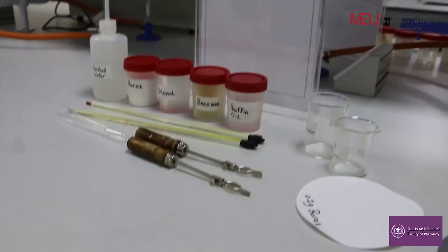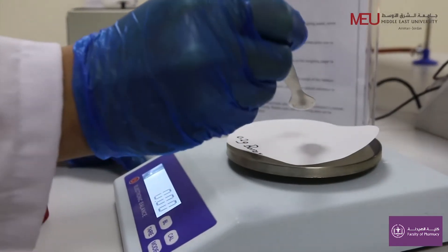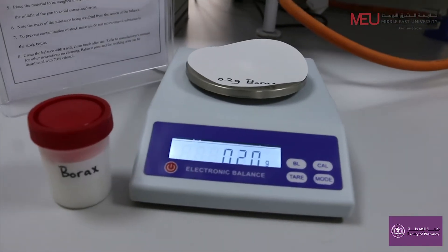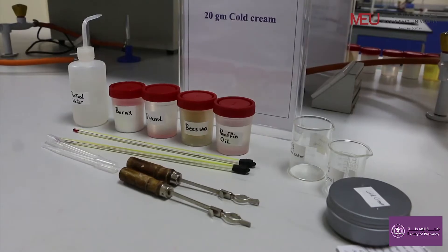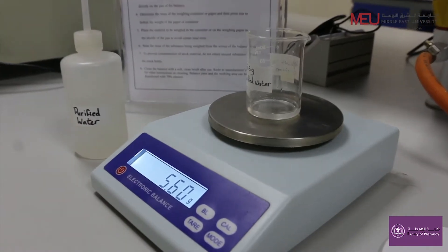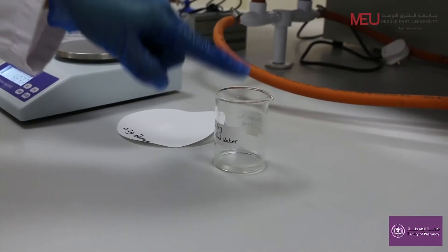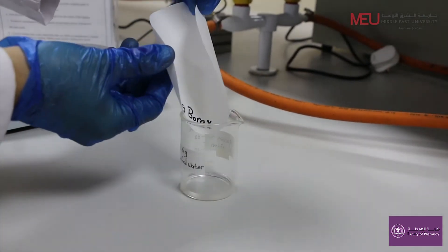Weigh 0.2 grams of borax. Here, borax is used as a whitening agent and emulsifying agent. Measure 5.6 grams of purified water — here purified water is used as a vehicle. Dissolve the 0.2 grams of borax in the purified water.